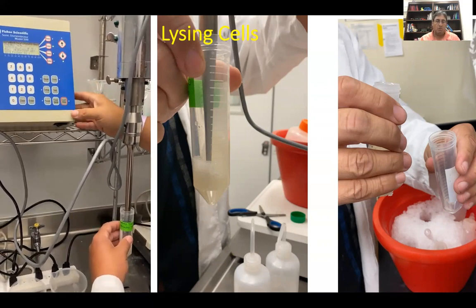How much and how long and the power that you use depends on the shape of the vessel, the depth and density of that sample in the vessel, and actually the location of the sample. You can't say X power unless you always have the same volume and the same kind of density in the same shape vial. So I literally start low, turn it up till I get a really robust sonication. You can feel it, you can hear it, you can see it. Let's see what that looks like here.